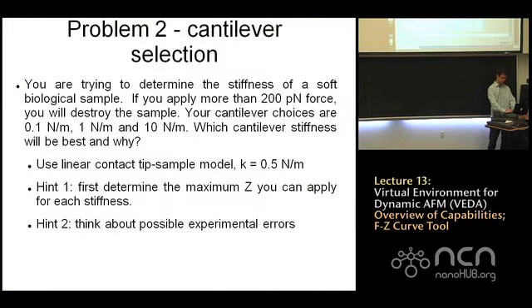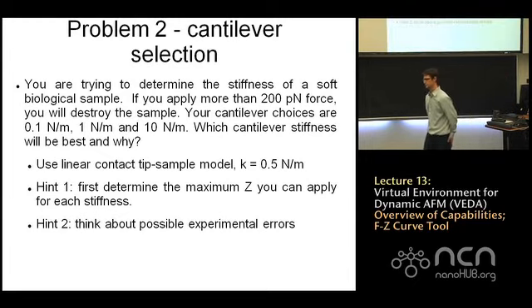Remember, you want to put in 0.5 Newton per meter for the stiffness of the sample.